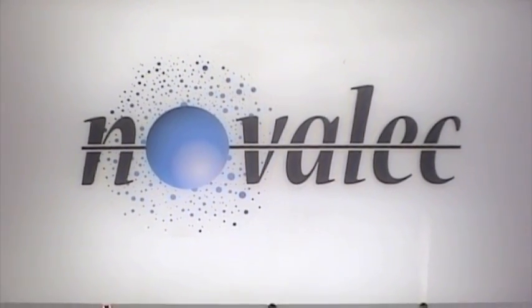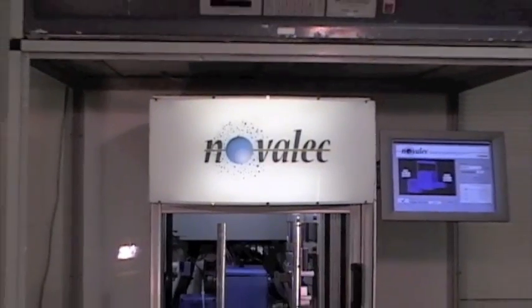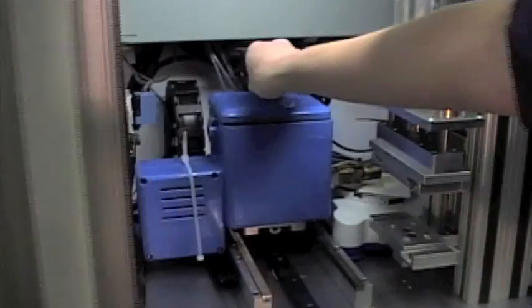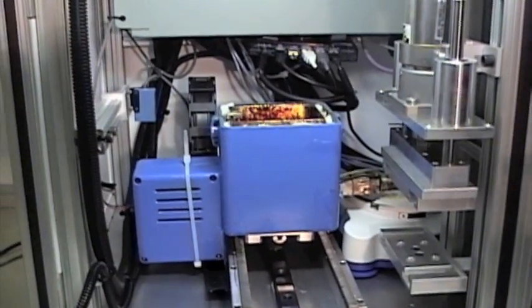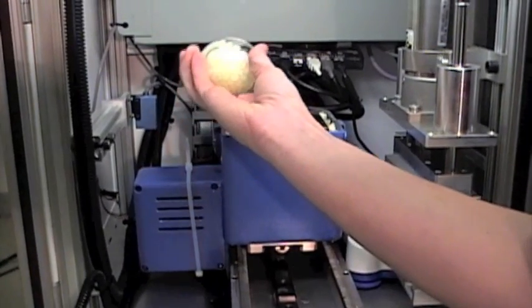The Novalec hot melt instrument is designed to test hot melt adhesive in a way that revolutionizes current testing practices. Novalec tests the strength of different types of hot melt glue by measuring the pull force needed to separate the glue with a load cell.